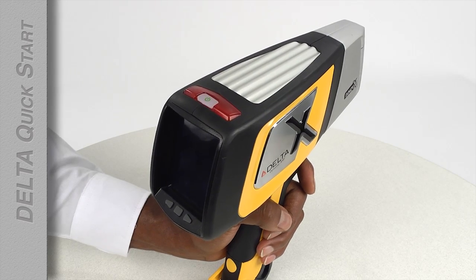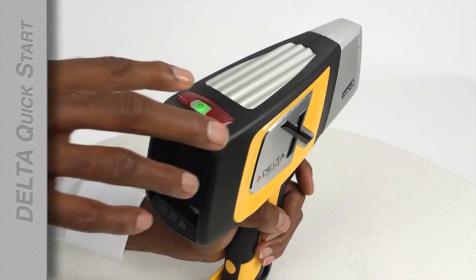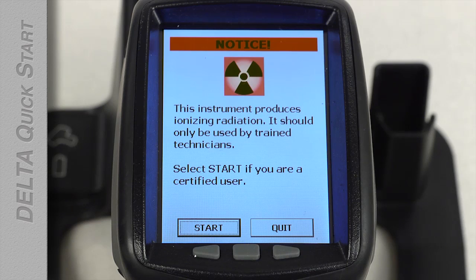Press the power button on the top of the analyzer. After it powers up, the radiation safety notice appears. After you read it, tap Start.